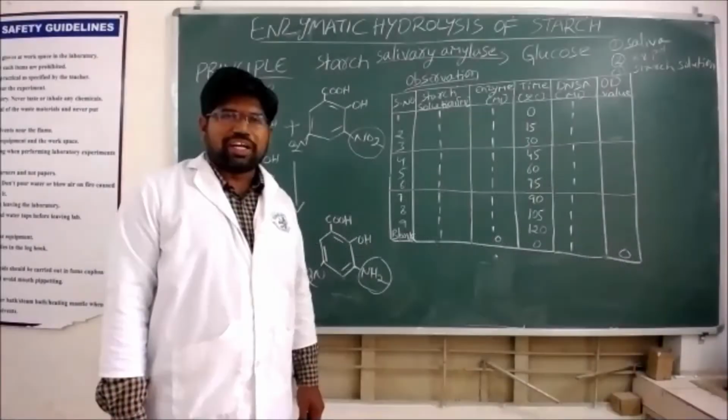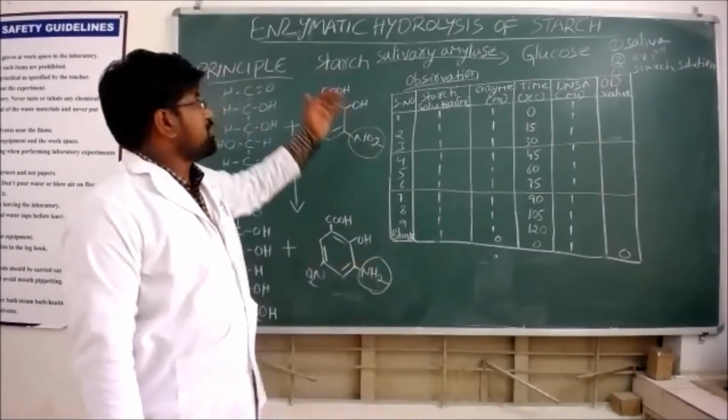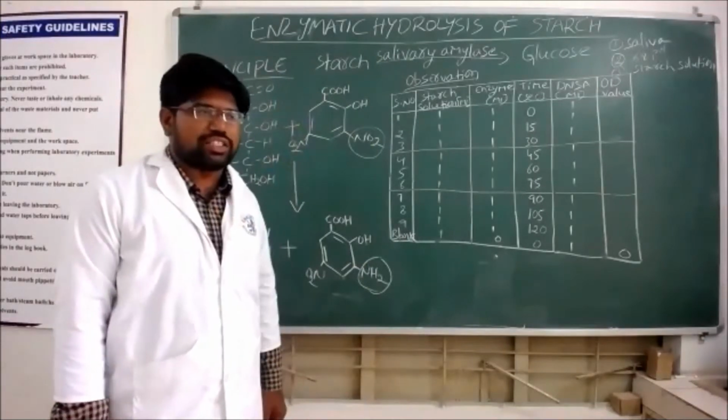Welcome to the practicals of biochemistry. So today we want to discuss the enzymatic hydrolysis of starch.